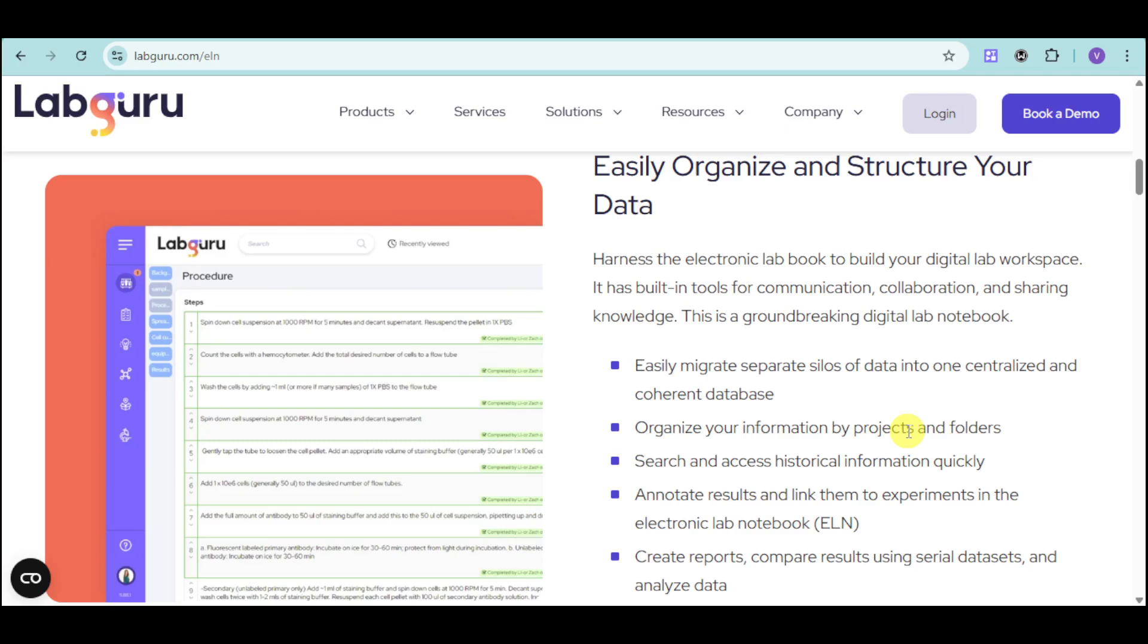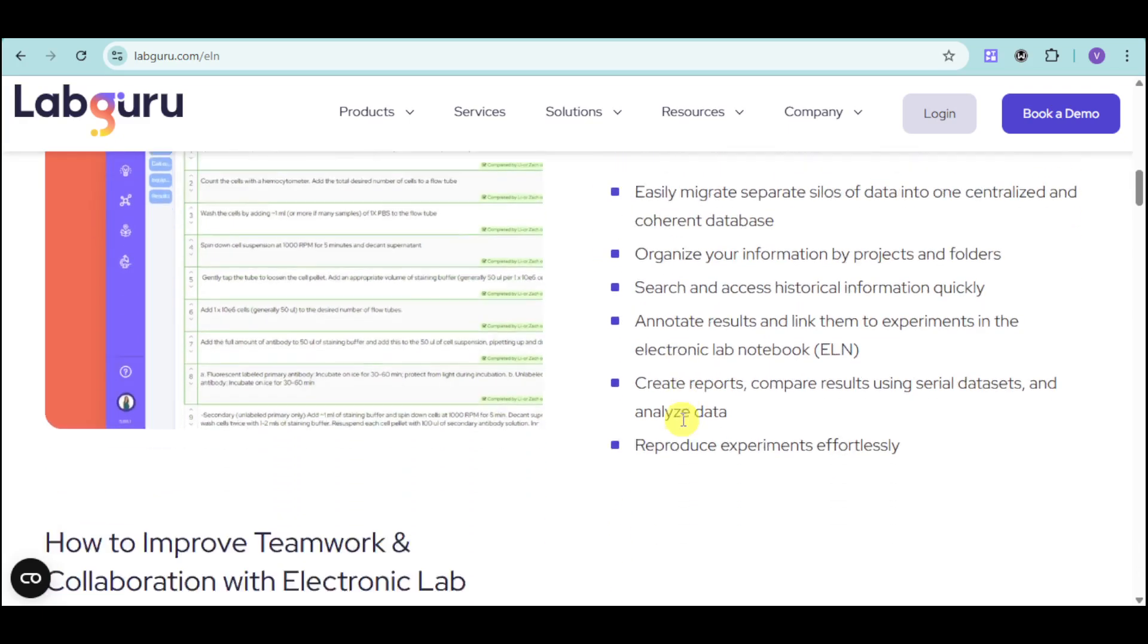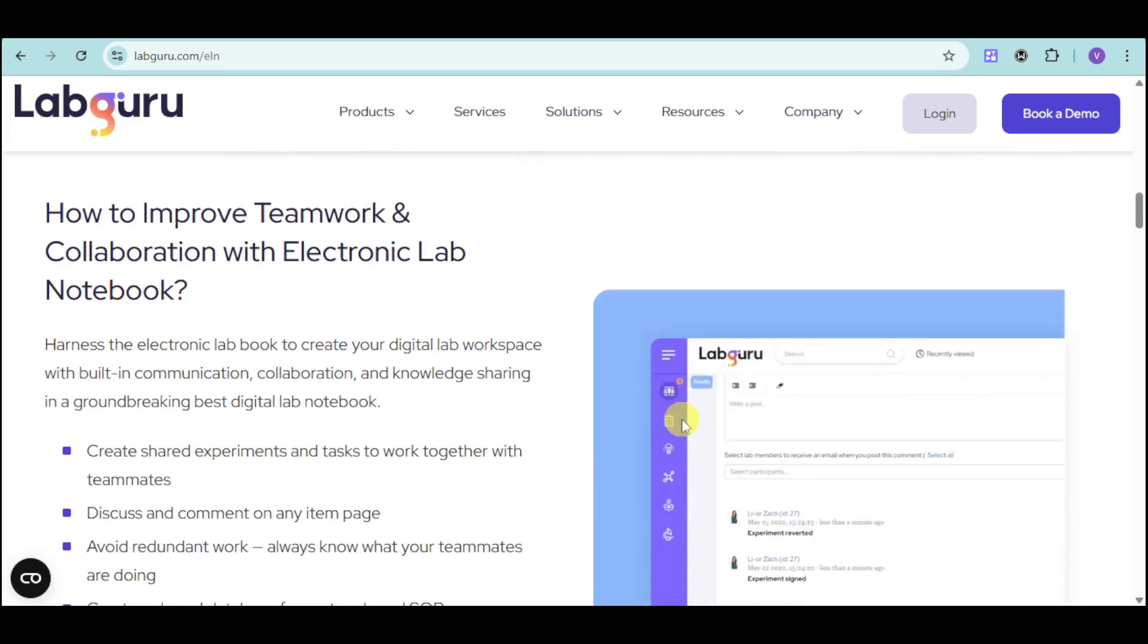You can easily migrate separate silos of data into one centralized and coherent database. You can organize your information by projects and folders, search and access historical information quickly, annotate results and link them to experiments with your ELN, as well as create reports and compare results using serial datasets and analyzed data.